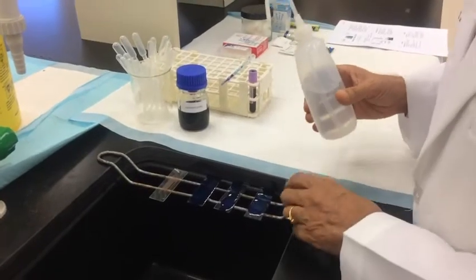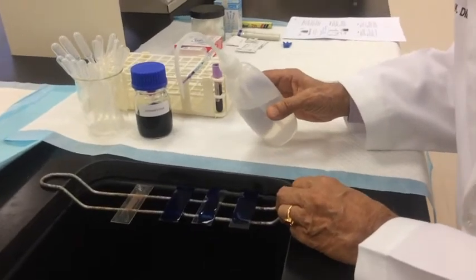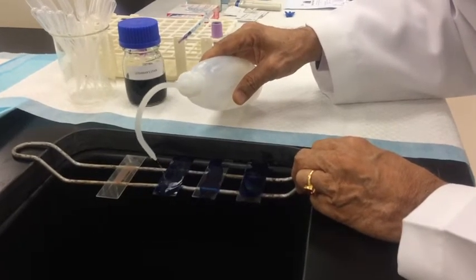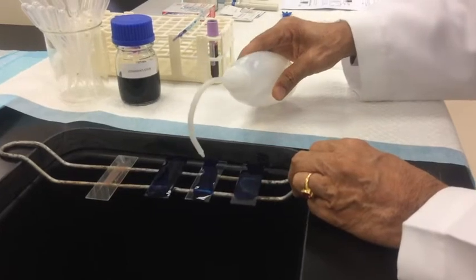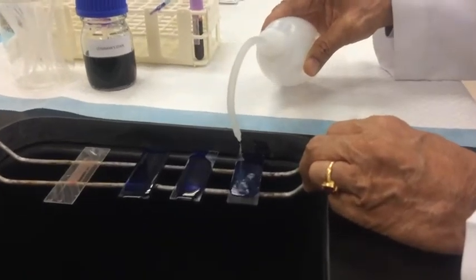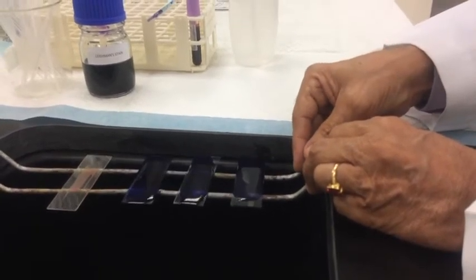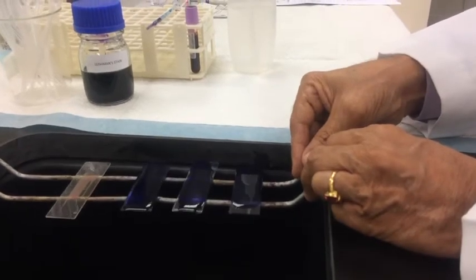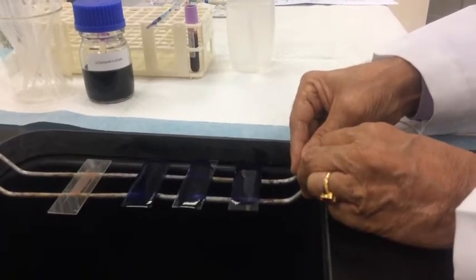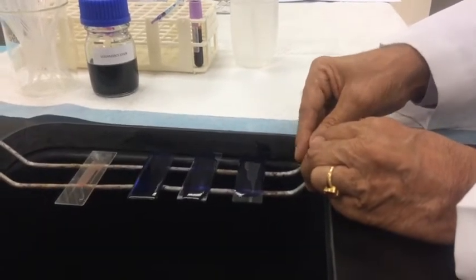After two to three minutes the fixation is complete. Without spilling the stain, add double the quantity of distilled water using a squirt bottle, taking care not to spill the fluid. Keep rocking and wait for eight to ten minutes, or a little more — this will be determined by trial and error based on the quality of your stain.